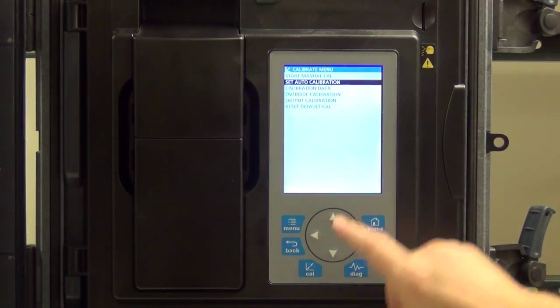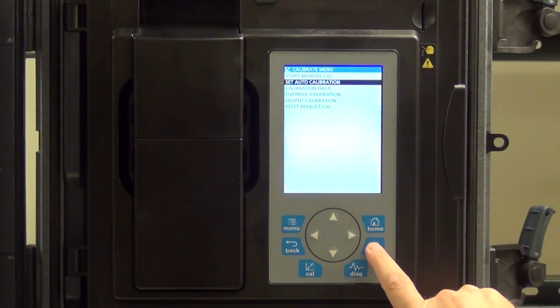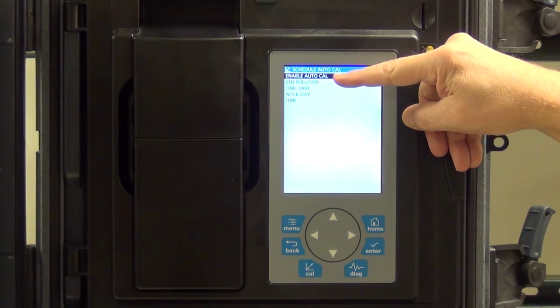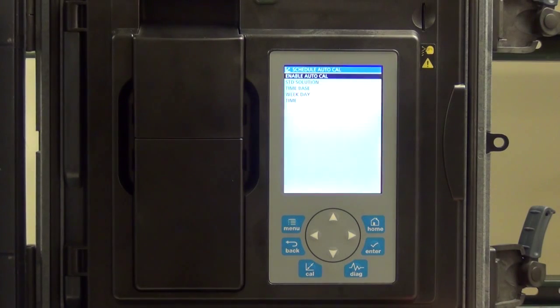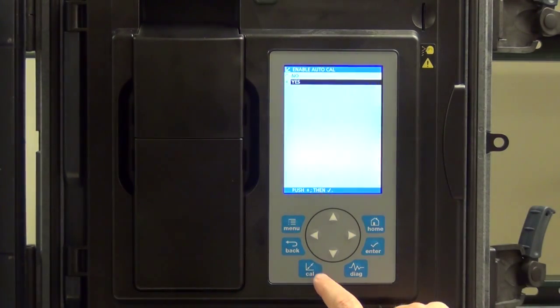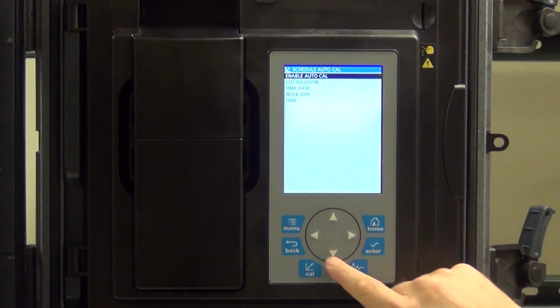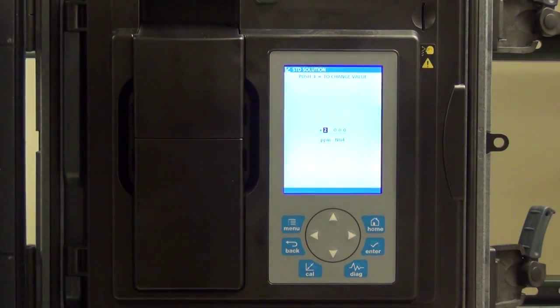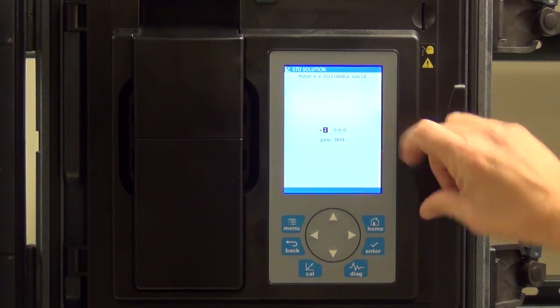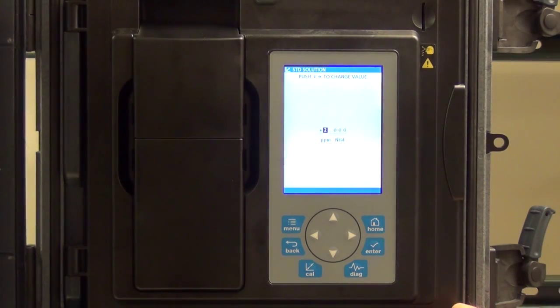Let's go down into Set Auto Calibration. First of all, we can enable or disable the instrument from doing a periodic automatic calibration. The default setup on the analyzer is for the auto calibration to be enabled. The standard solution that is used is a 2 part per million ammonium as nitrogen standard. So that's the default standard that the instrument is shipped with.